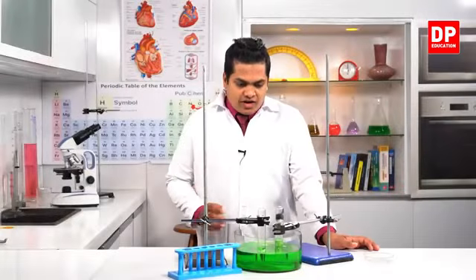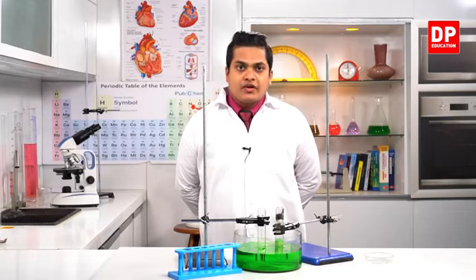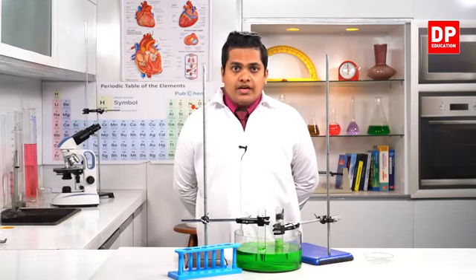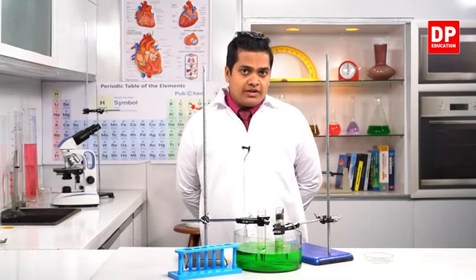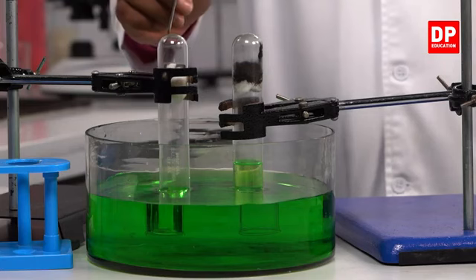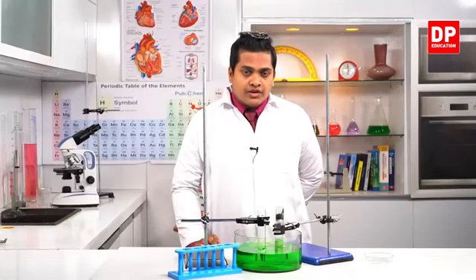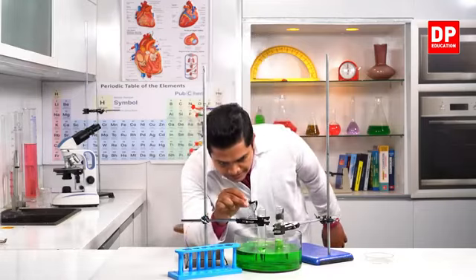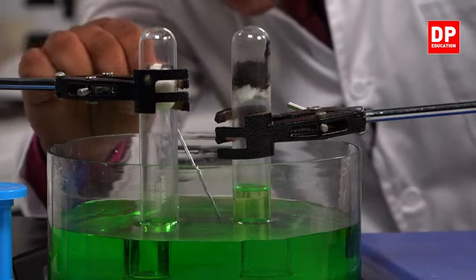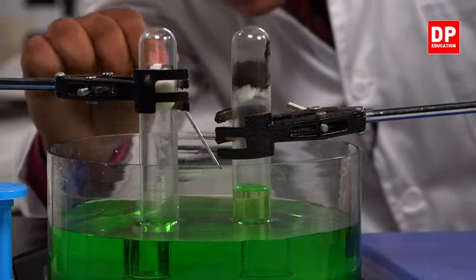Right, my dear children, now you can clearly observe what has happened to our setup. After adding colored water, we can get the necessary observations more clearly. This is our first test tube. This is our second test tube, which is used to compare the volume of water. Here you can see from this level, this is our normal water level. From this level to this level, water has risen up.